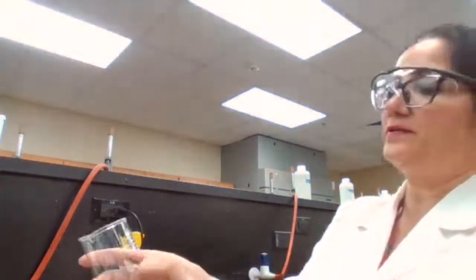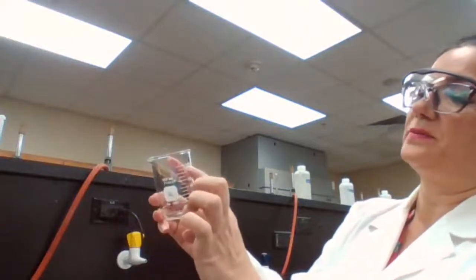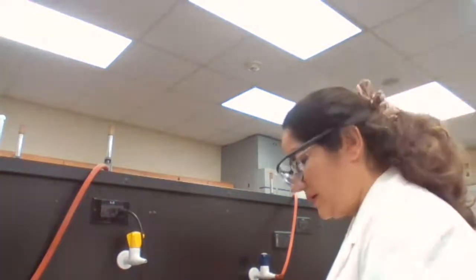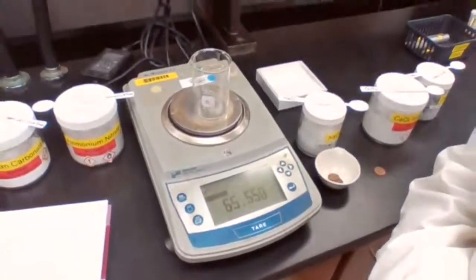Second, the mass of a 150 milliliter beaker. The lines go up to 140, but the title is 150. We take the penny out and place the beaker, and record the mass for the beaker. The mass of the beaker now is 65.550 grams.